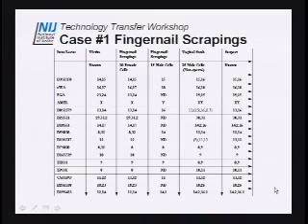So some of the work here would probably get better results now. Okay, here we got 15 male cells. We do get a partial profile. Again, the suspect is on the far right-hand side of the known. We do get a lot of haploid types, or a lot of single types. But what's important is that in every instance here, the type that was obtained was characteristic of, or found within, the suspect's type.